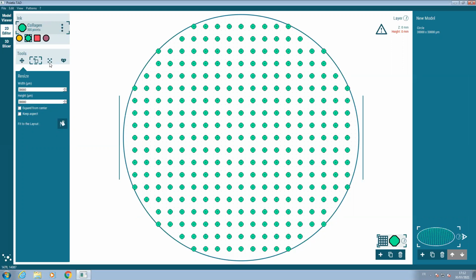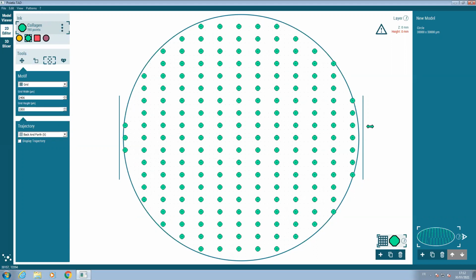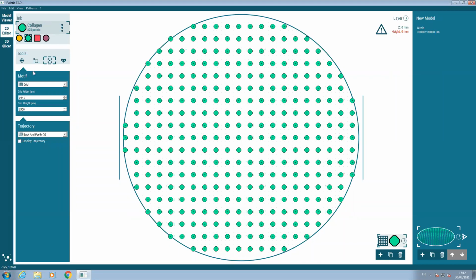And then, so you can play with the spacing between the patterns. So you've got different kinds of patterns. It can be a grid, it can be equidistant, it can be free draw, gradients. I will show it later. And now you can adjust the spacing between your droplets. And if you know the real size, you can obtain a confluent layer of it.